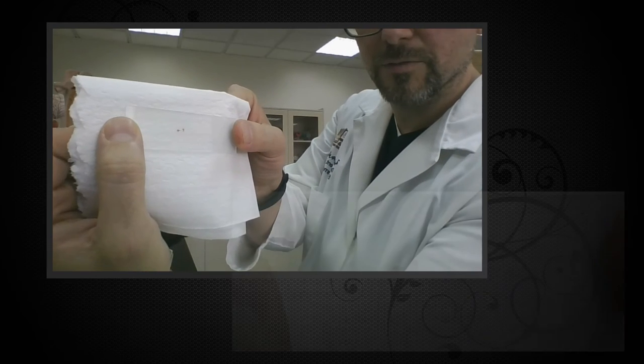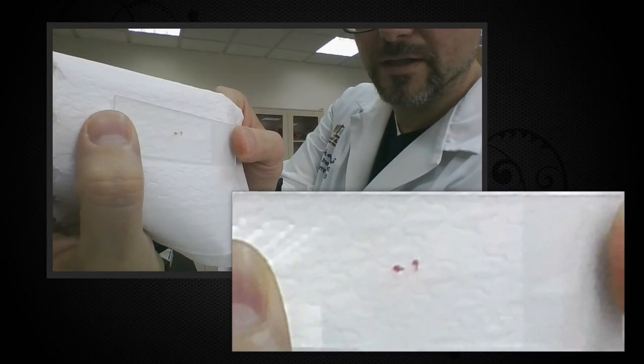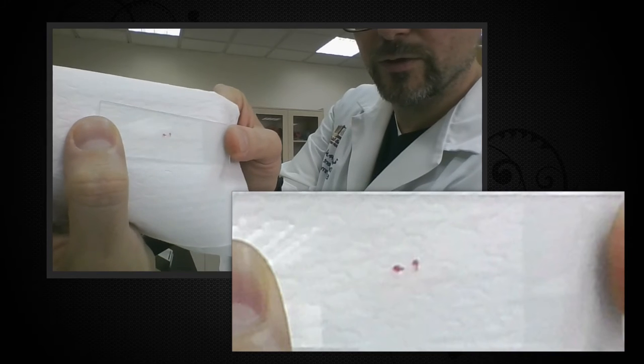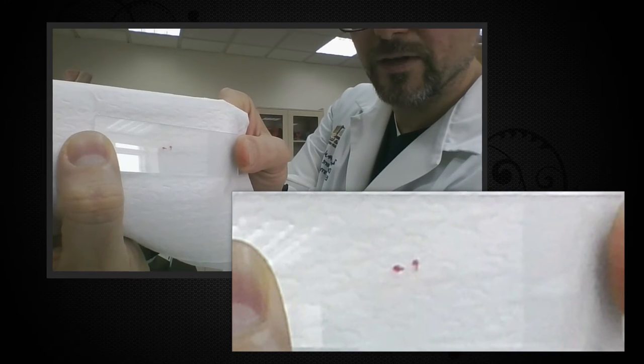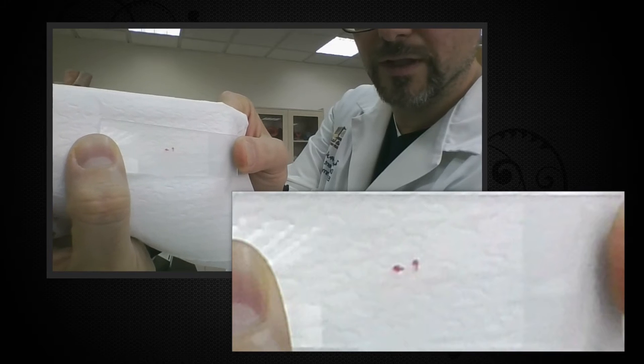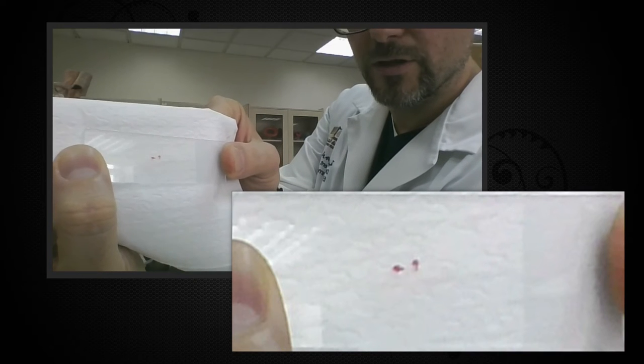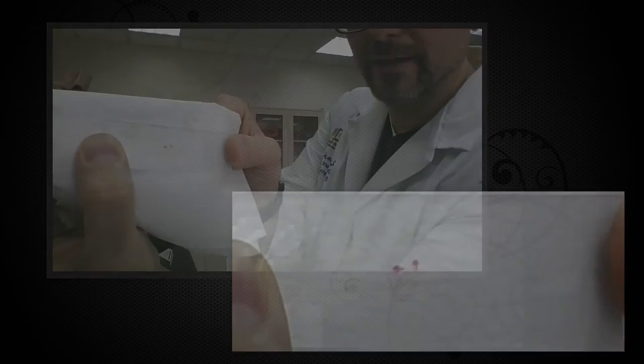So here you go, I've drawn some very small arrows on a slide. And what we're going to do is we're going to look at these arrows under the microscope to see how they move. So I will show you a video of both the stage and also what you see through the ocular lens.